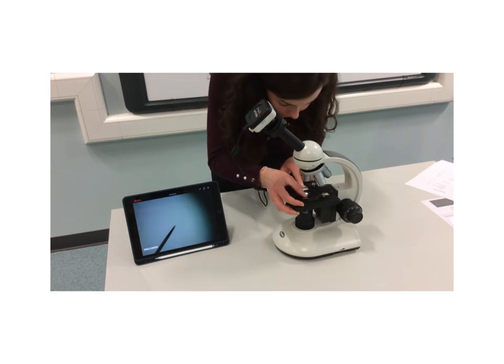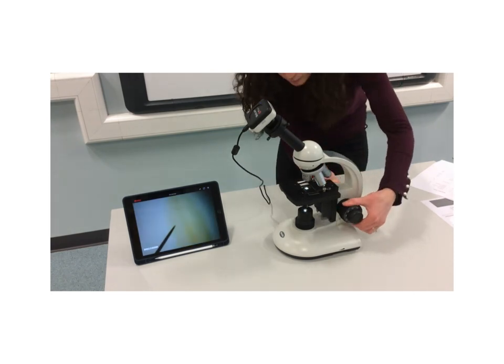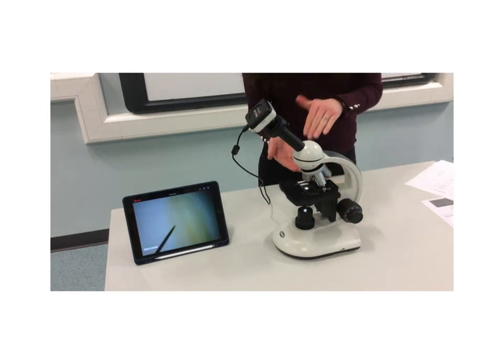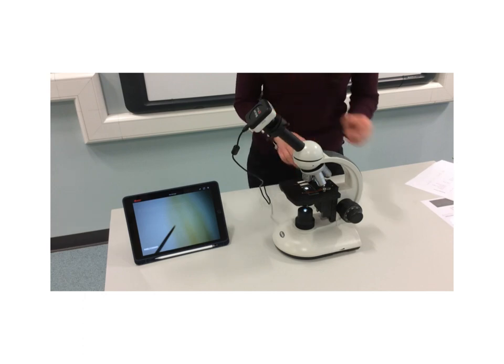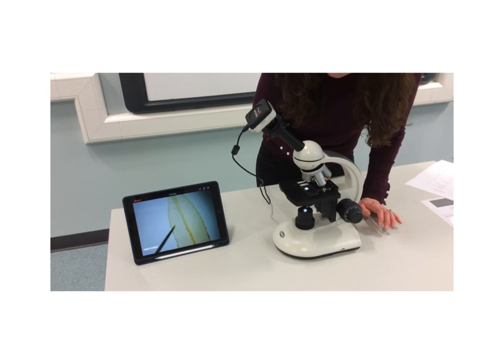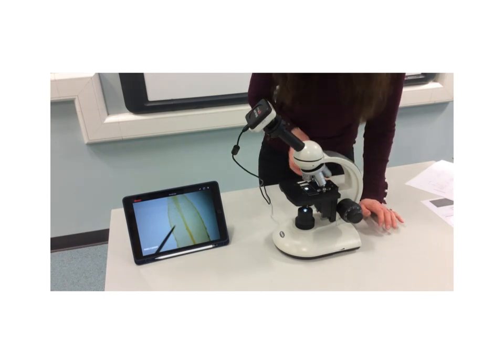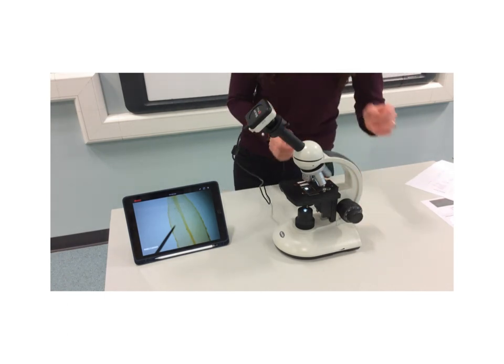So let me put that over to the point where I think we'll see an image. And again, what I'll do is I'll wheel that up so it's the smallest distance between the objective lens and the stage, but making sure they don't touch. And then I'll focus away. So I'm turning the coarse focusing knob until I see an image. Can you see it now? Hopefully you can see our leaf. And I'll use that fine focusing wheel to get it into better focus. Hopefully you can start to see the little cells in the moss leaf.